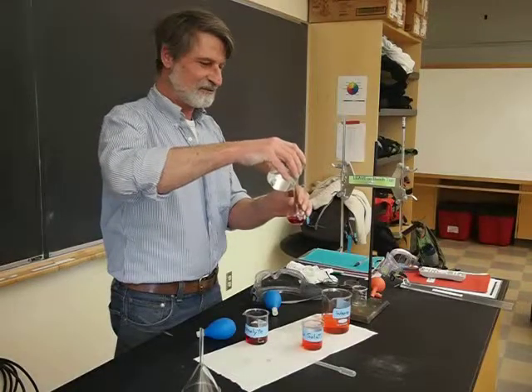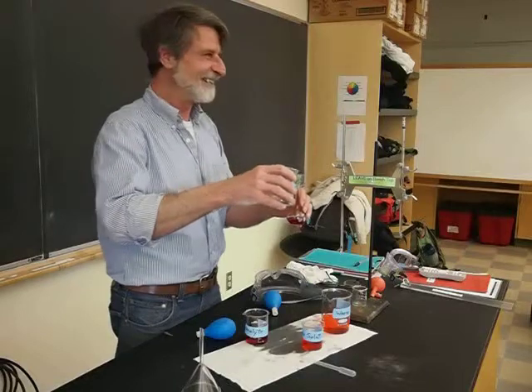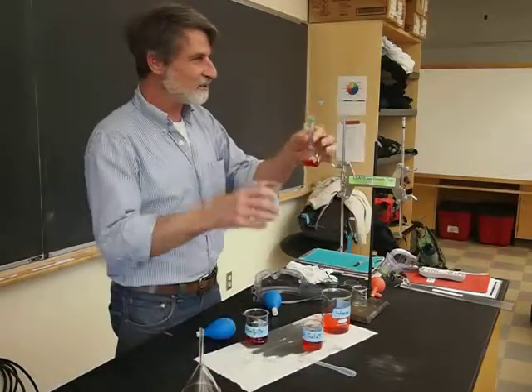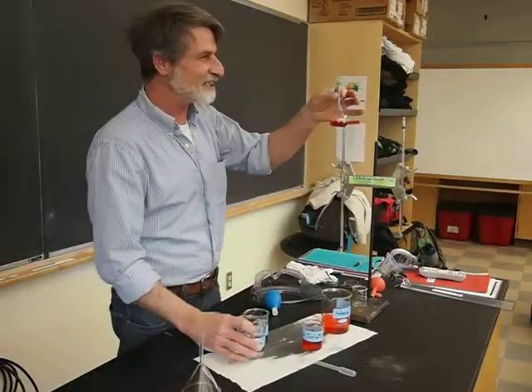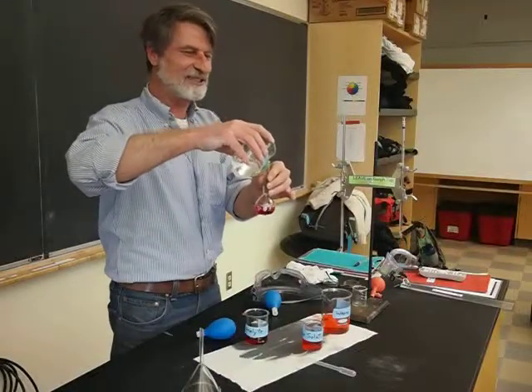I love to just splash it all over the place to show that it doesn't really matter what gets on the outside, right? It only matters what gets on the inside. What malaria is that acid? It also is good for a laugh.